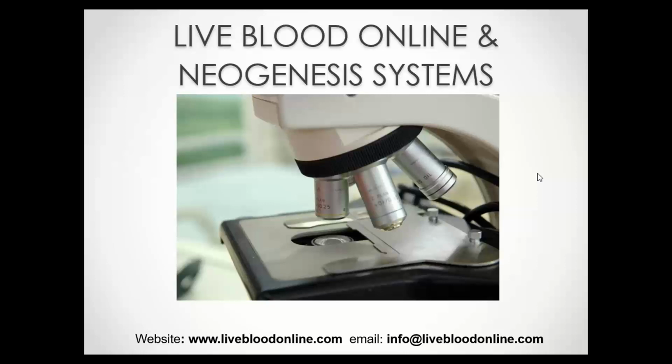what does live blood analysis actually show? All right. Well, live blood analysis is a test that's ideal for any natural health, nutrition, or functional medicine practice, since it gives us information about specific key parameters that we, as natural practitioners or practitioners in this field, need to test and monitor to be able to decide on the best treatment or interventions for our clients.